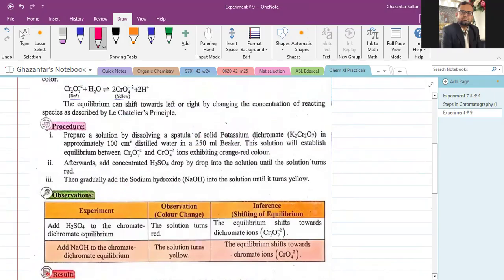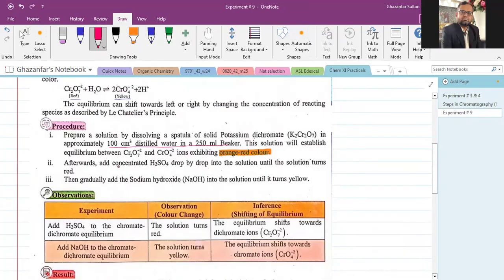Procedure: Prepare a solution by dissolving a spatula of solid potassium dichromate(VI) in approximately 100 cm³ of distilled water in a 250 ml beaker. If using a 100 cm³ beaker, take a proportionally smaller quantity of water. The solution will establish equilibrium between dichromate(VI) and chromate ions, exhibiting an orange-red color. Afterward, add concentrated sulfuric acid or HCl drop by drop until the solution turns red, then gradually add sodium hydroxide until it turns yellow.